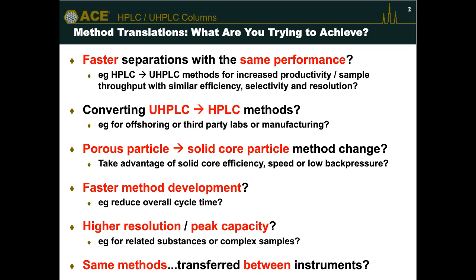And that can be just another HPLC. It doesn't mean it's moving from HPLC to UHPLC. It could just be another HPLC system from a different supplier. So we need to consider those certain parameters to make sure the method works accurately and reproducibly on both systems.